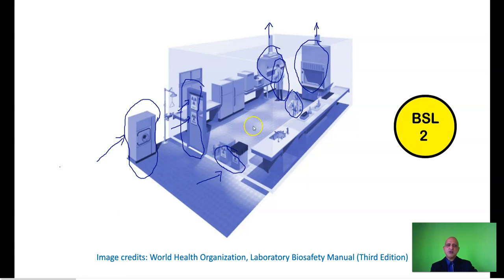So if you are working on the bench with the biological agent, the flow of the direction of the air is this way. It enters into the fume hood and then exits the facility via a HEPA filter. So this accords a certain degree of protection to the laboratory users. The placement of this fume hood is very important.